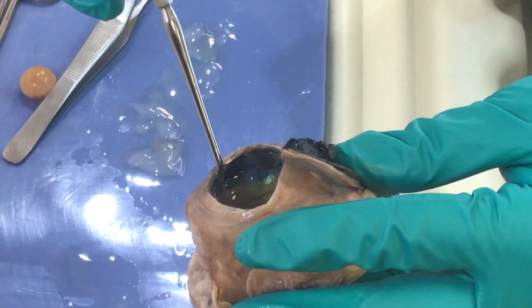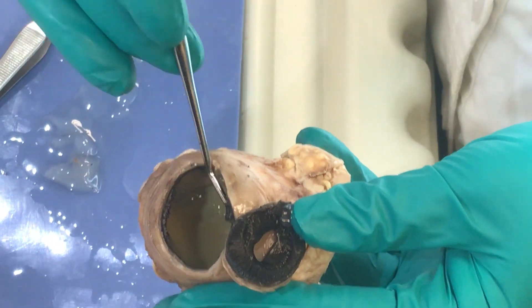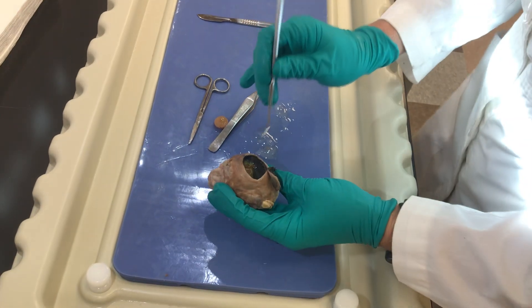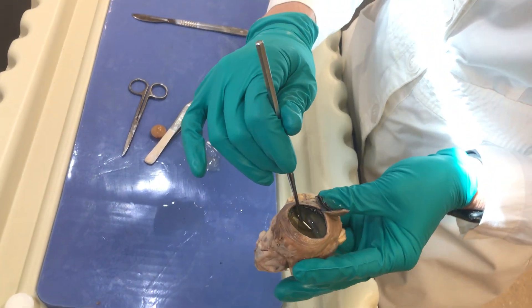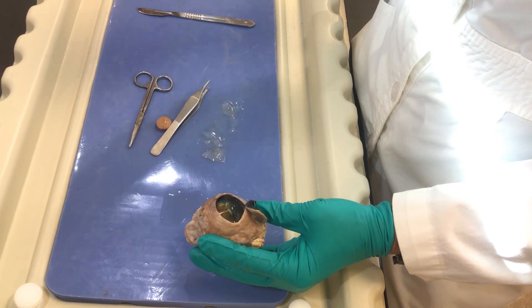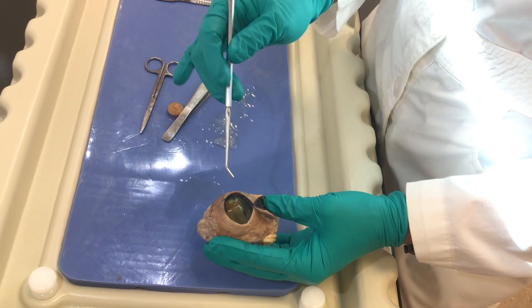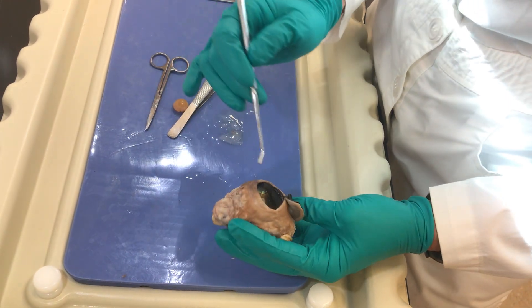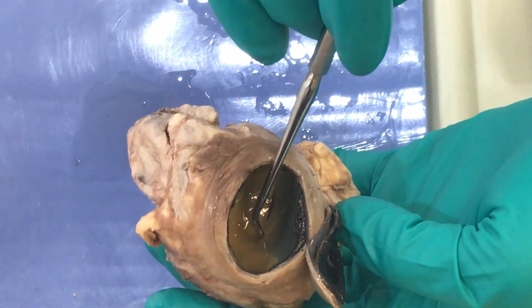The choroid houses the vessels that supply the eye, and inside of that we have the retina. When you're looking at the retina, it doesn't look like too much — it's tan and bland. Remember, it is three layers of cells: the outermost layer are your photoreceptors, then toward the middle are the bipolar cells, and then the ganglion cells. The axons of all the ganglion cells leave the eye at the optic disc, and you can see everything coming together right there.